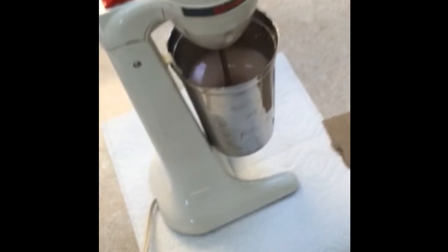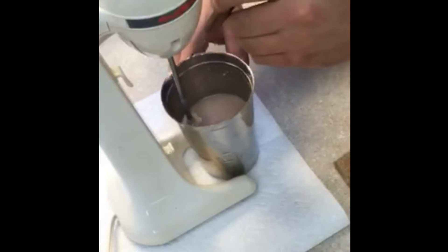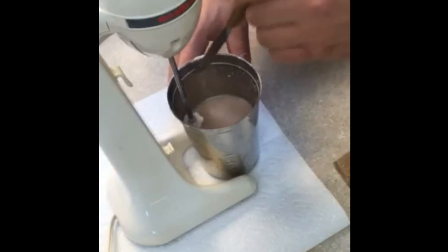Let's go through. What you have here is just a standard mixer. The procedure calls for a milkshake mixer to mix the slurry of bentonite and water together.